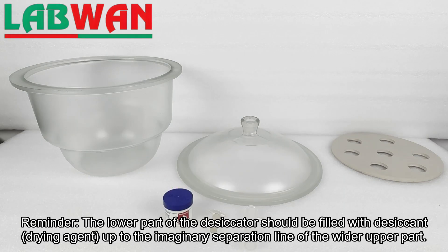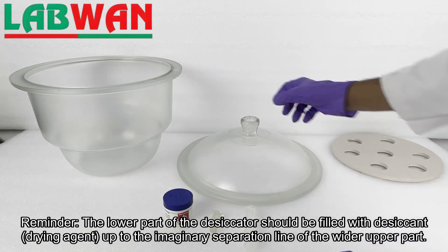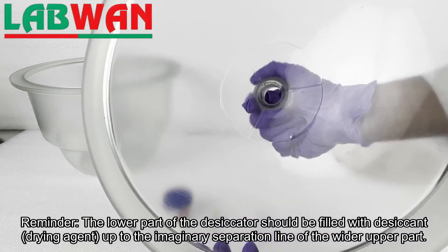Reminder: the lower part of the desiccator should be filled with desiccant, a drying agent, up to the imaginary separation line of the wider upper part.